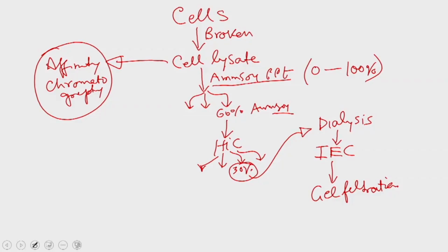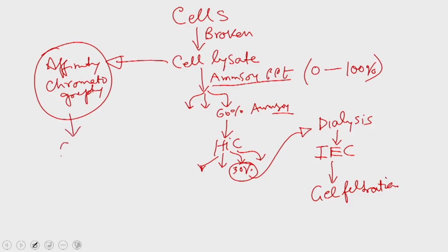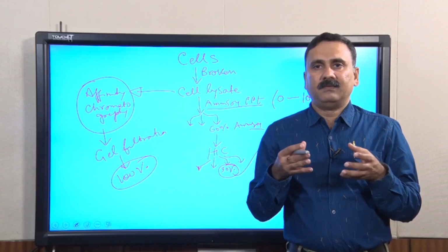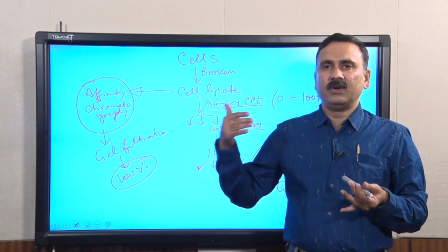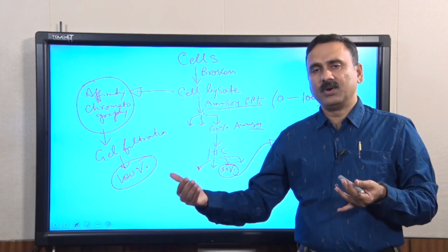In a single step you may get more than 90% purified protein. Once you are done with this, you can simply run the gel filtration chromatography, and that will give you almost 100% pure protein, because gel filtration chromatography may remove some of the aggregated material from your protein, giving you close to 100% purified protein.